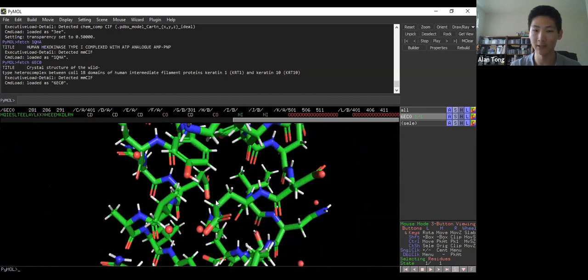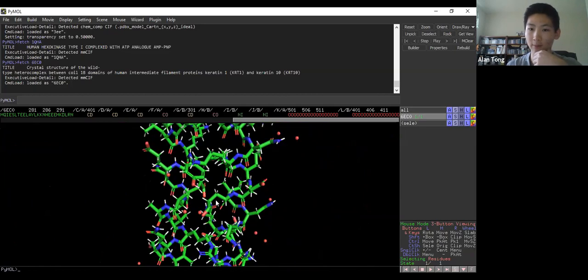Now, this is a little complex to look at, all right? I went on the website and the proteins have random letters and numbers for some reason. Yeah, they all have a unique code. They all have a specific code that means if you fetch this, it's that specific protein. Those numbers and letters don't necessarily mean something. I mean, they might, but it's not really important.